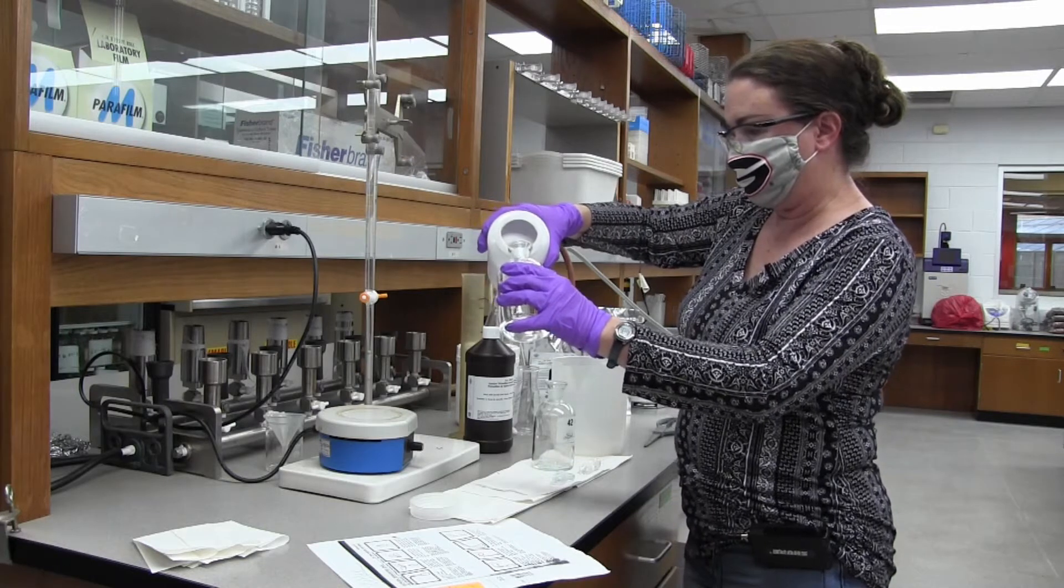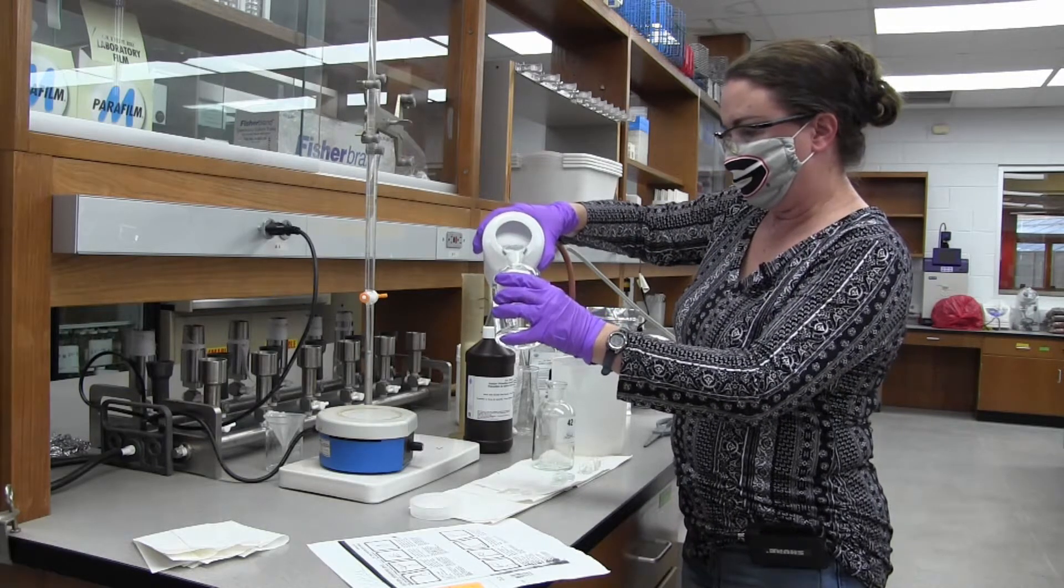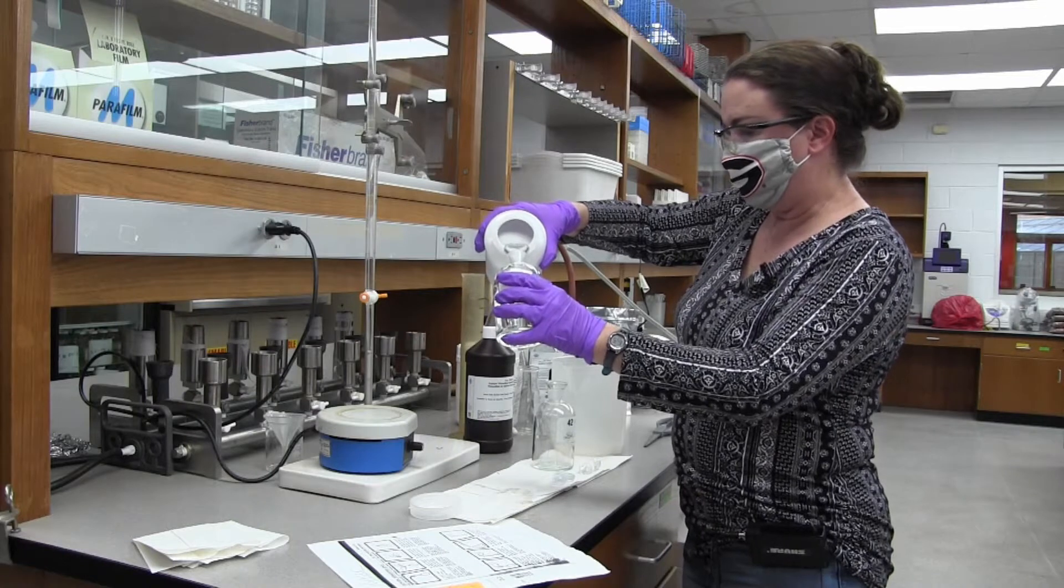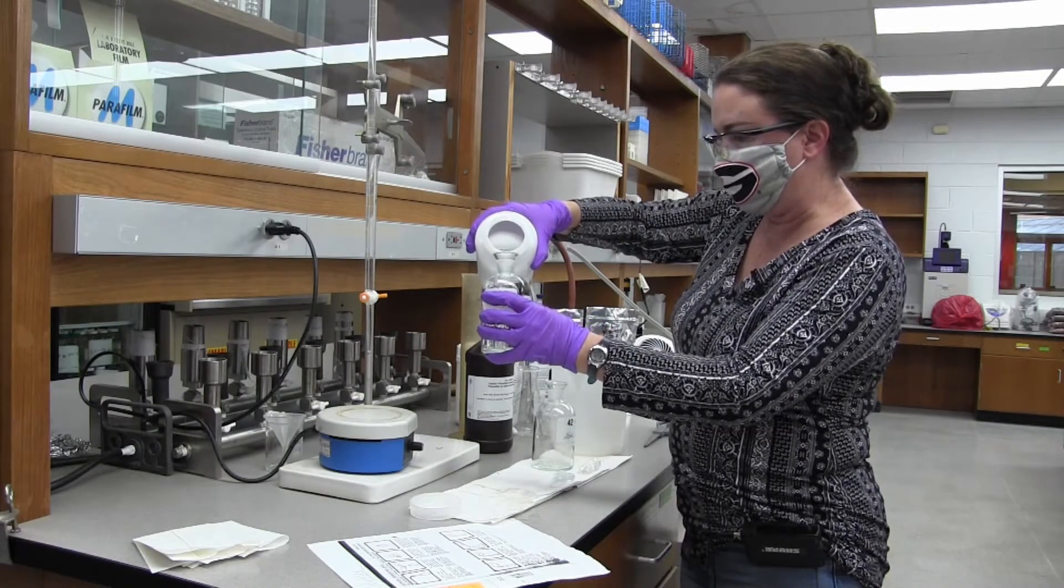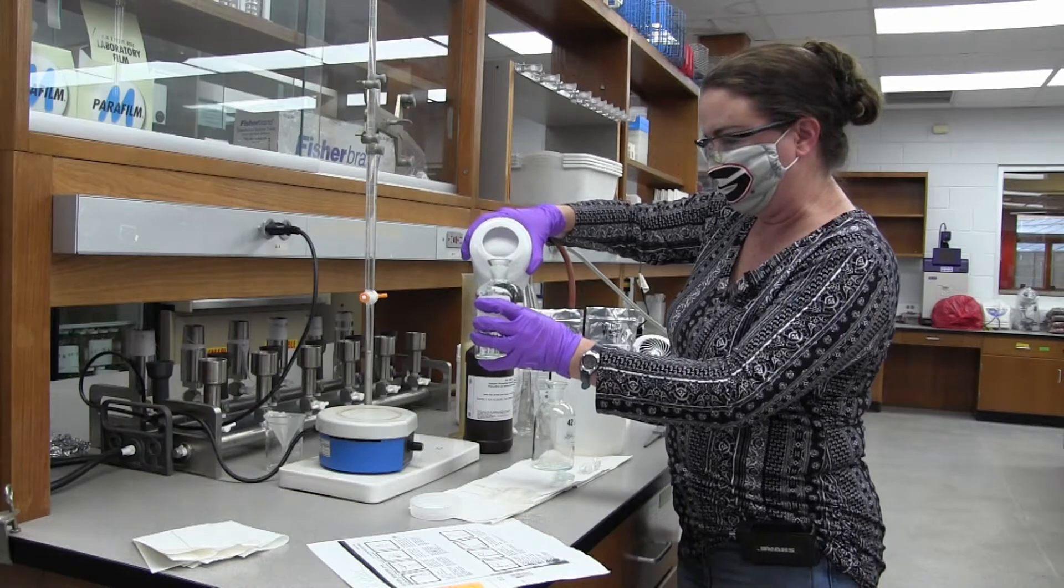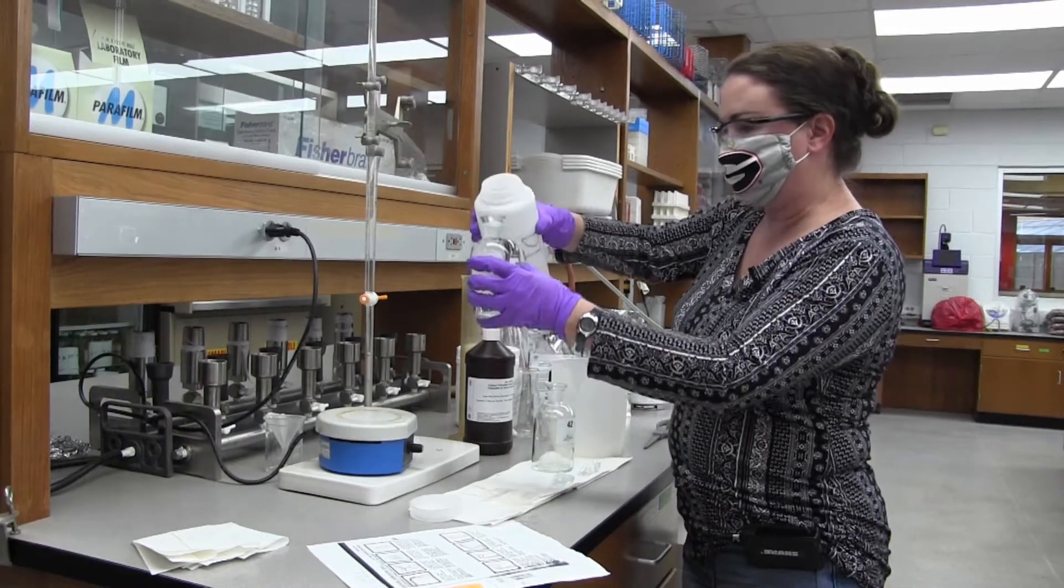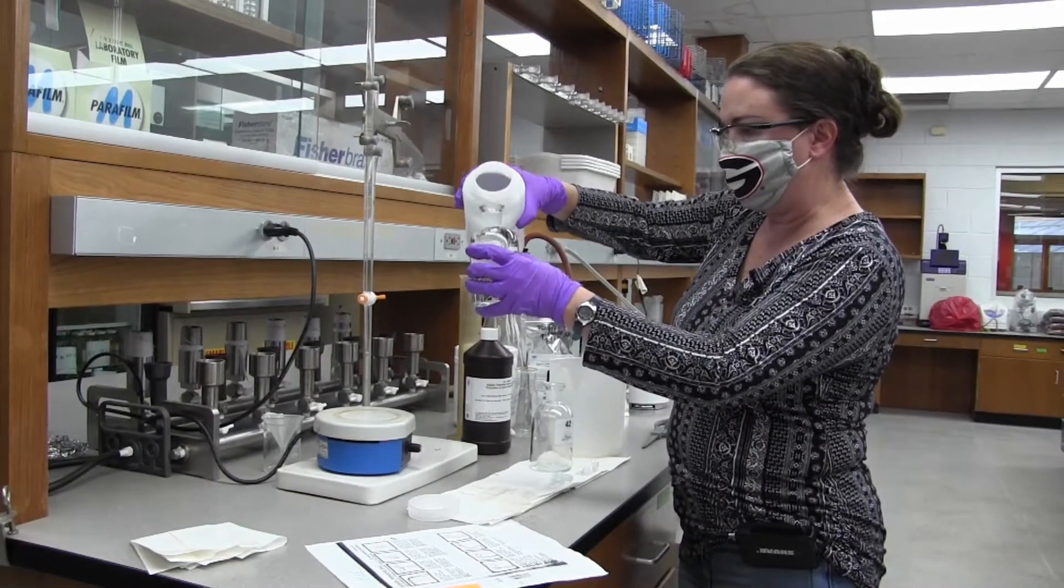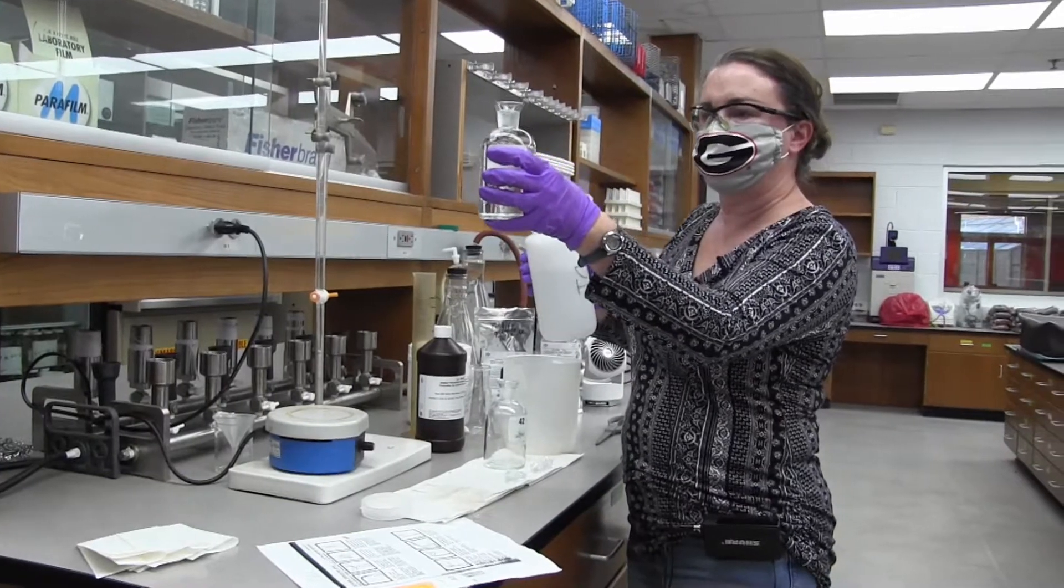Just slowly pour. And it might be a good idea to have some paper towels on hand because this gets messy. I usually pour it to the top of the frosted area if you're using a glass BOD bottle.